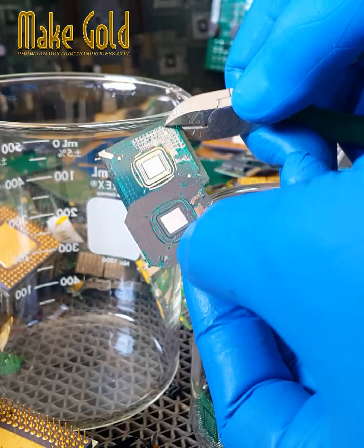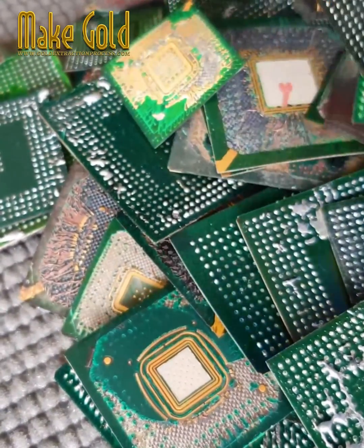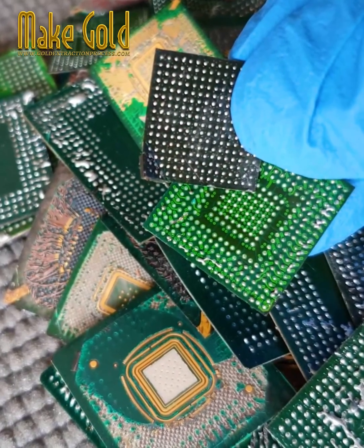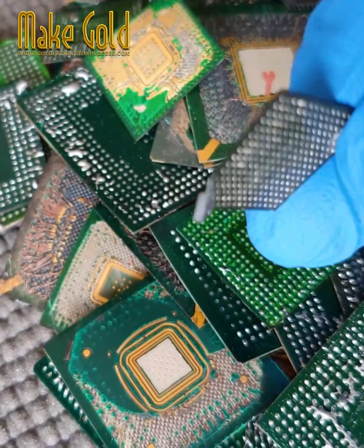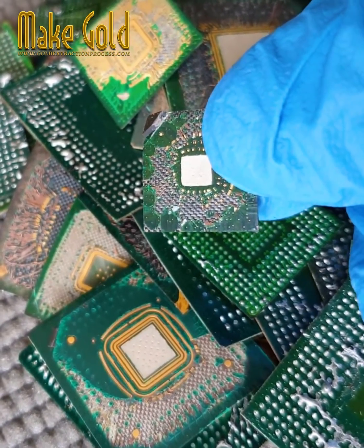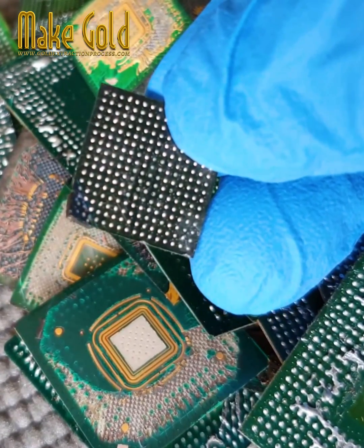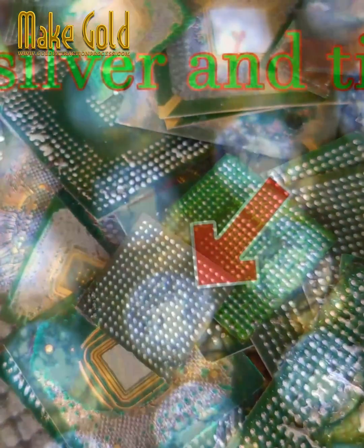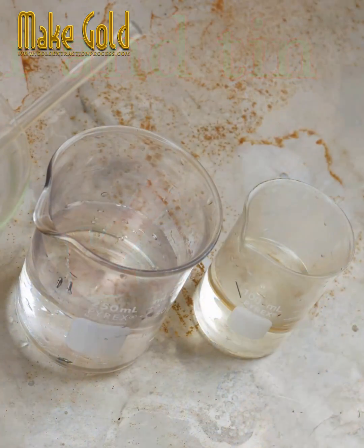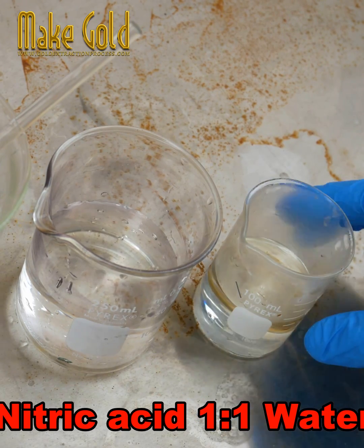Recovering silver from e-waste is a similar process to mining for gold but with a few key differences. Sources of silver in e-waste include silver contacts and pads on printed circuits, electronic components containing silver such as capacitors and switches, and silver solders. The process uses nitric acid mixed with water to dissolve the solder balls.